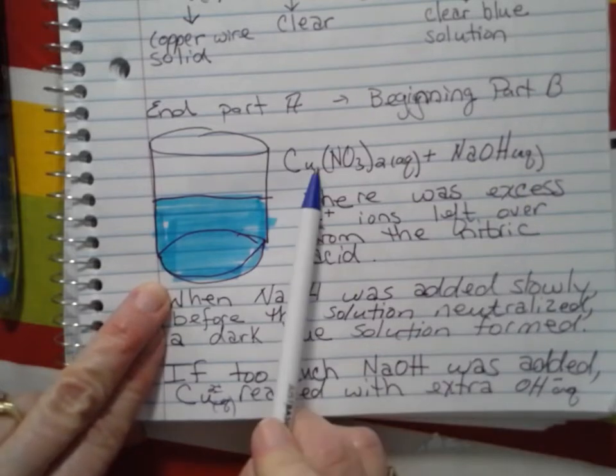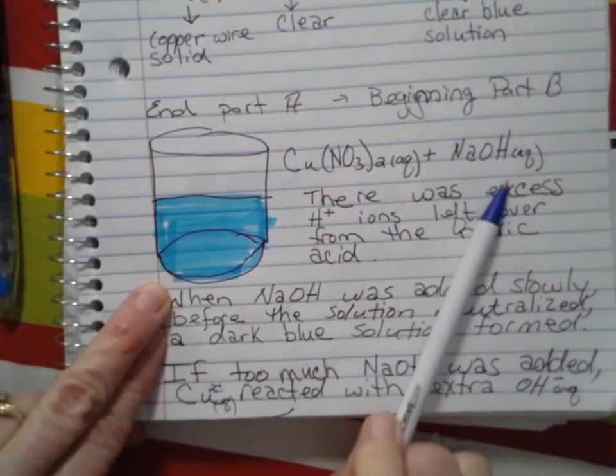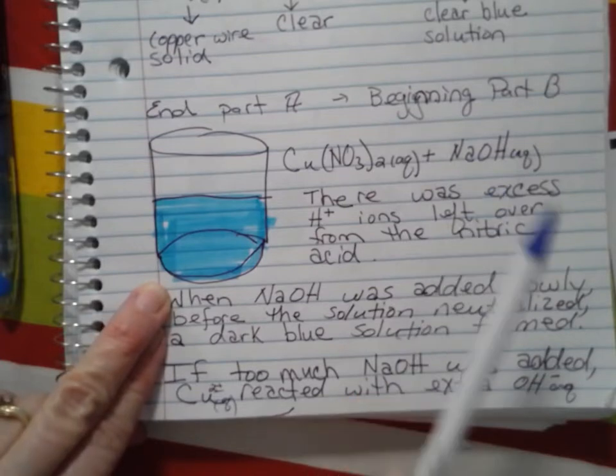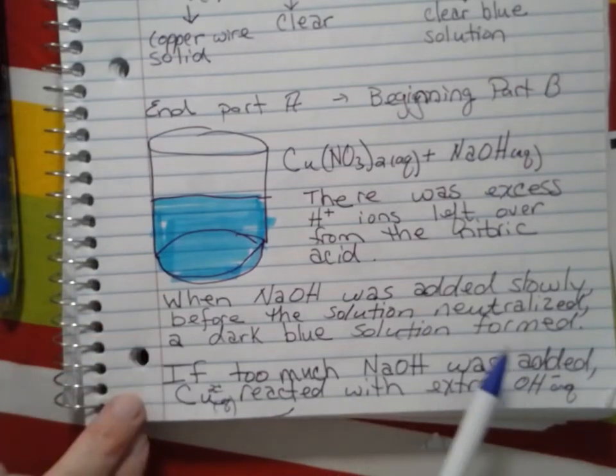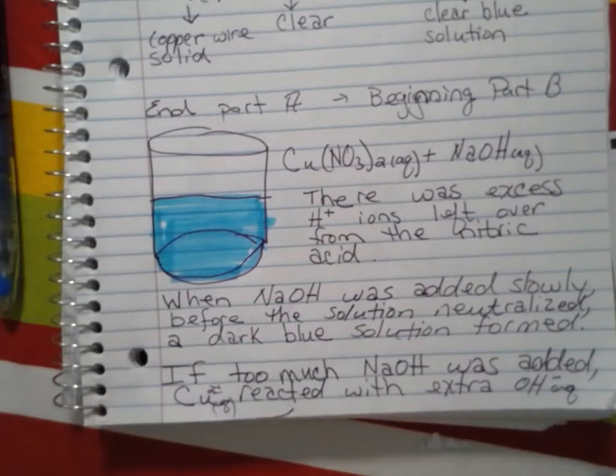The copper was not affected with this neutralization reaction unless we went over. Remember, if we added too much of that sodium hydroxide solution, every time we put some of that sodium hydroxide in there, we got this blue precipitate, that dark blue precipitate.